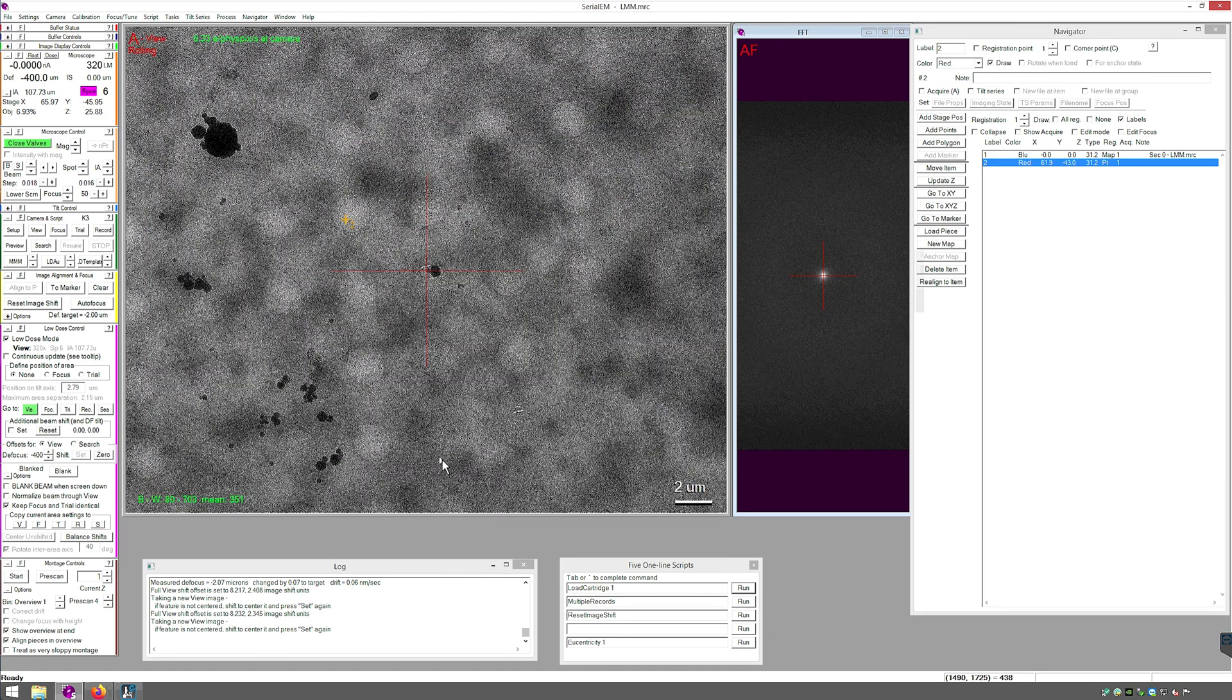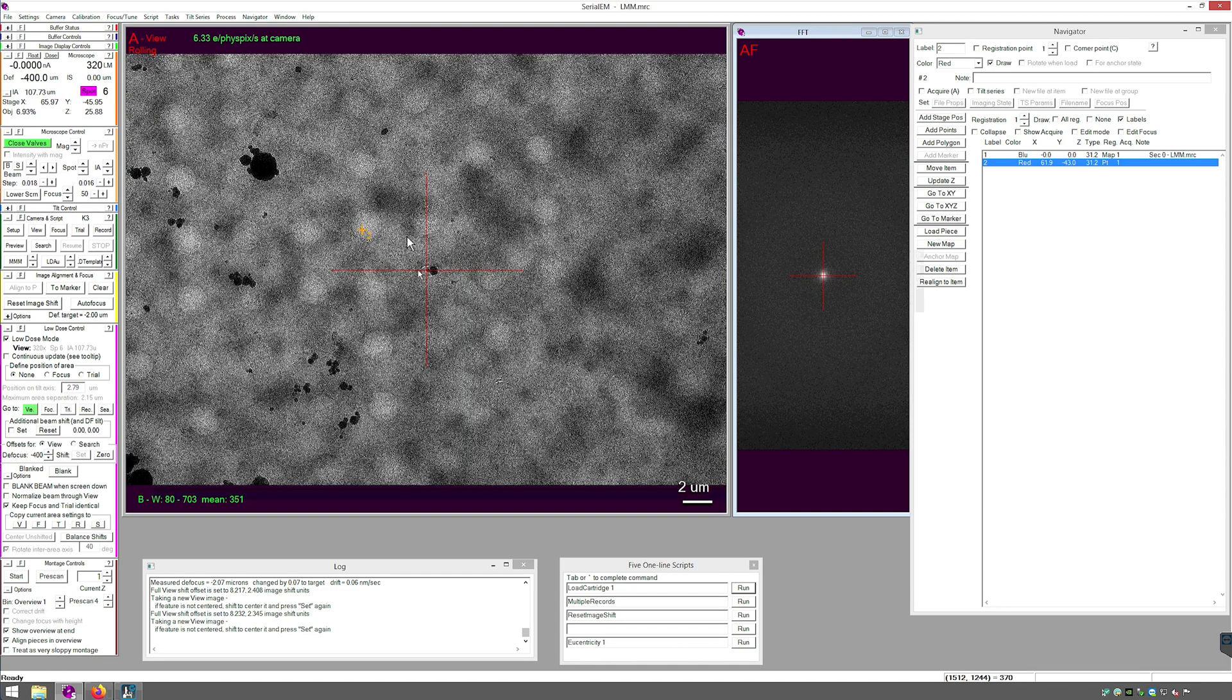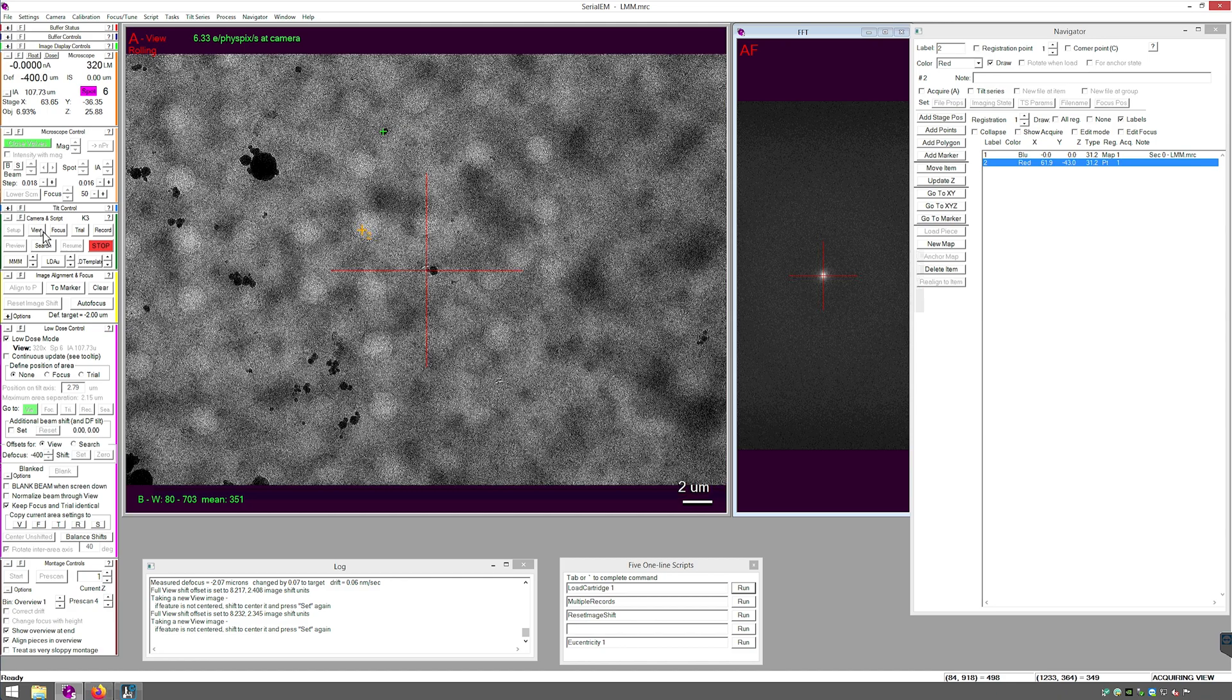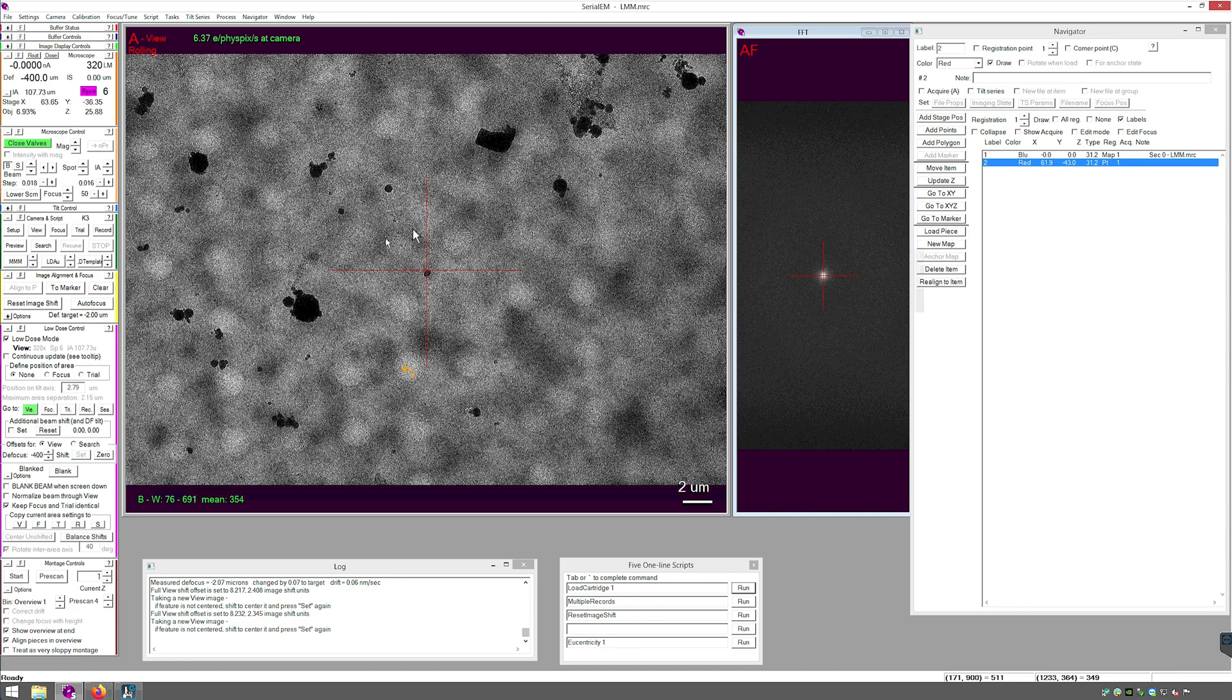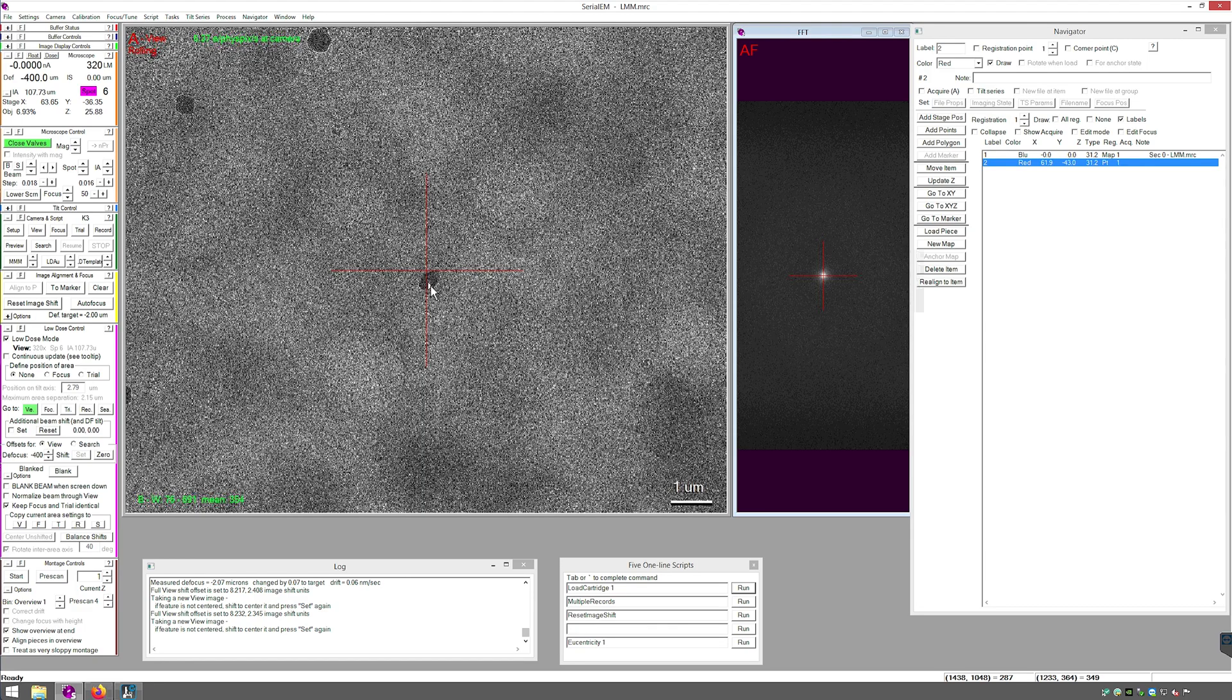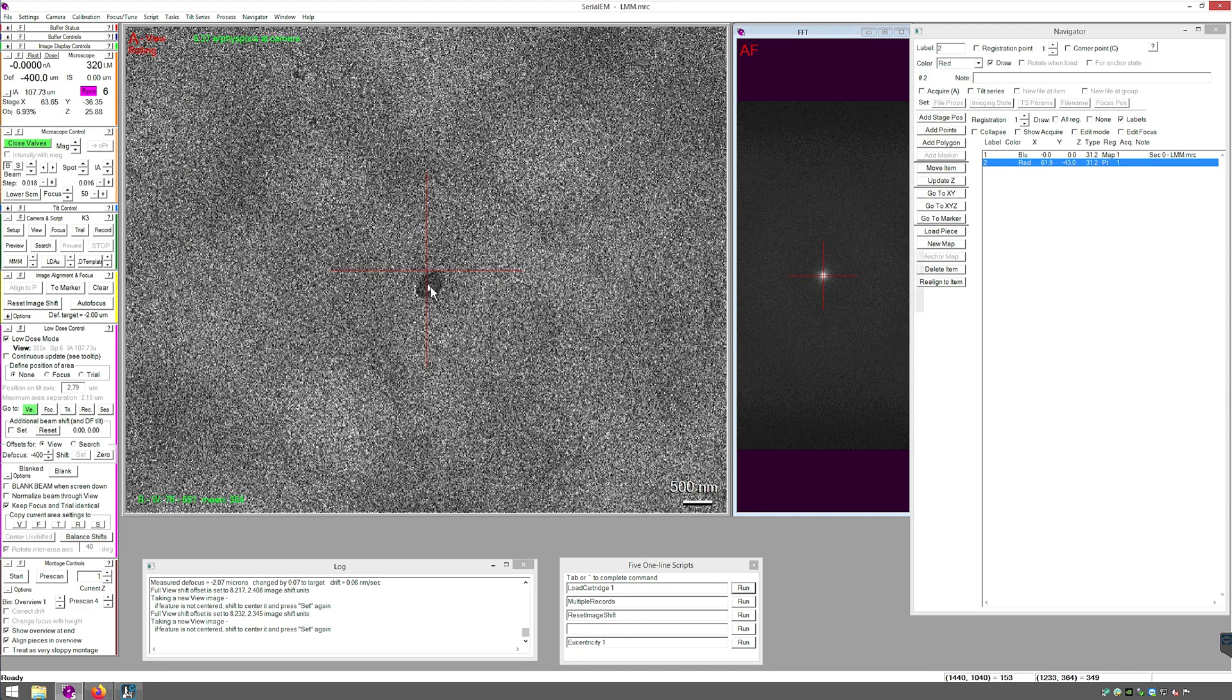Now to verify that I accurately created this offset, I can now navigate to another feature. Go to marker, center it in view. And that should now be centered in record.